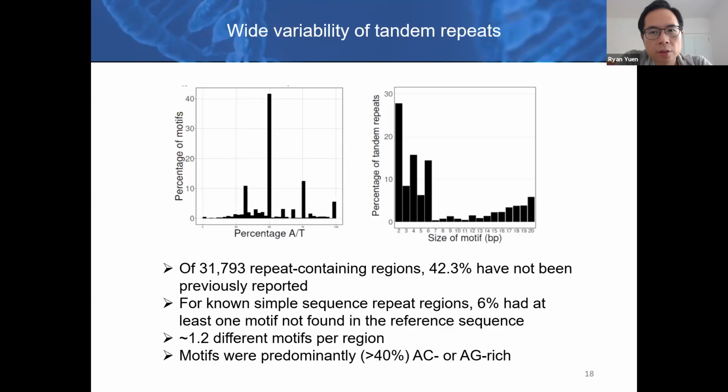If you read the paper, most of the time when we talk about the size, we only use the percentile or the normalized length. If we want to know the exact size or the zygosity, we would use ExpansionHunter. Knowing exactly where the region is, and what the detected motif is in that region, we can size the repeat more precisely. But that is also a bit challenging. I don't have time to elaborate, but it has still proven to be challenging.